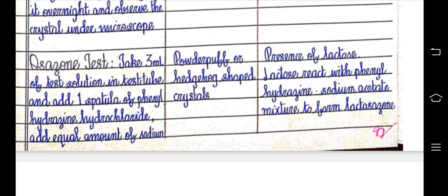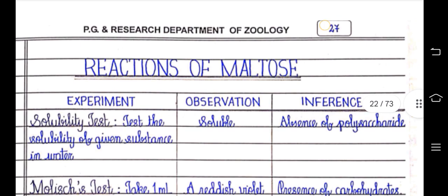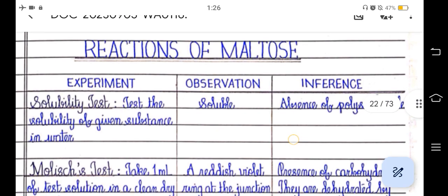Lactose reacts with phenylhydrazine sodium acetate mixture to form lactosazone. Reactions of maltose.